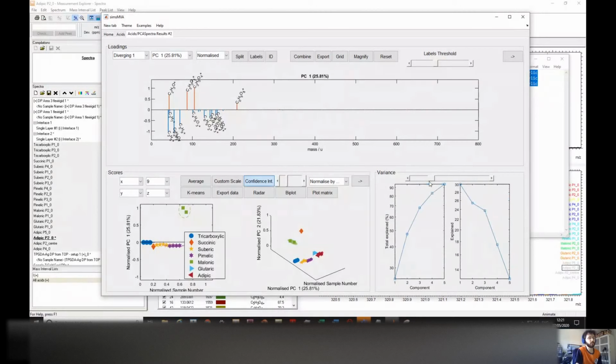So there are a few rules to define which are the relevant PCs. One of them is whenever you go over 95% of total explained variance, the other principal components will be noise. So I always add this value here as well to guide us where this happens. But not necessarily this is always the case. Sometimes you have relevant things over 95 or not relevant things under 95.